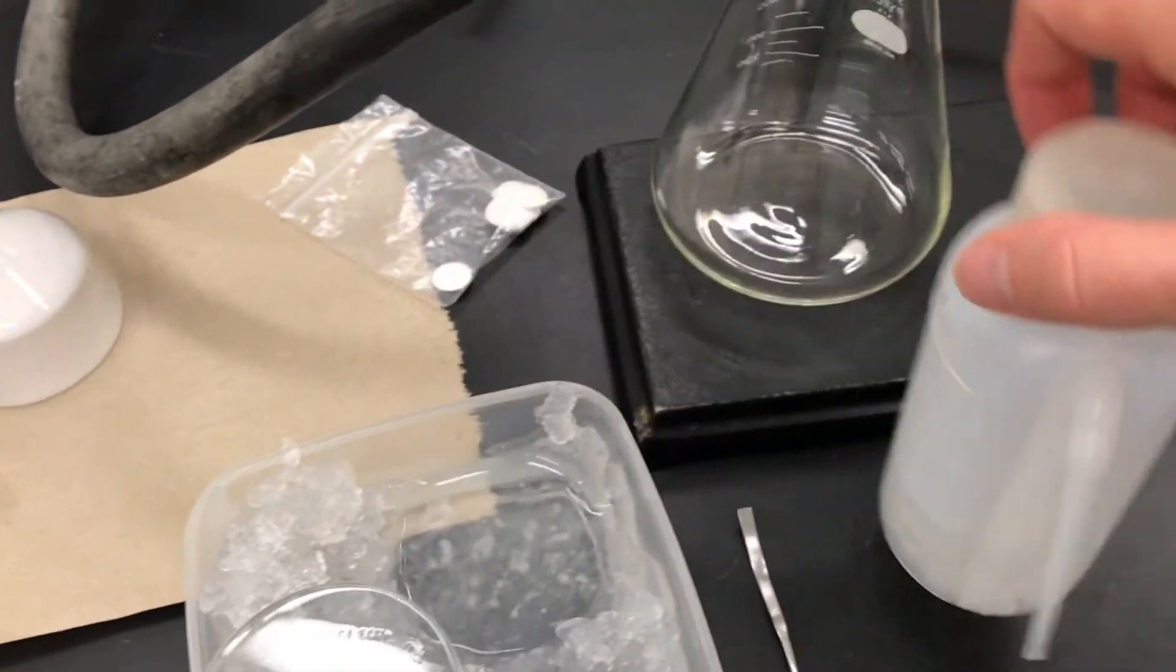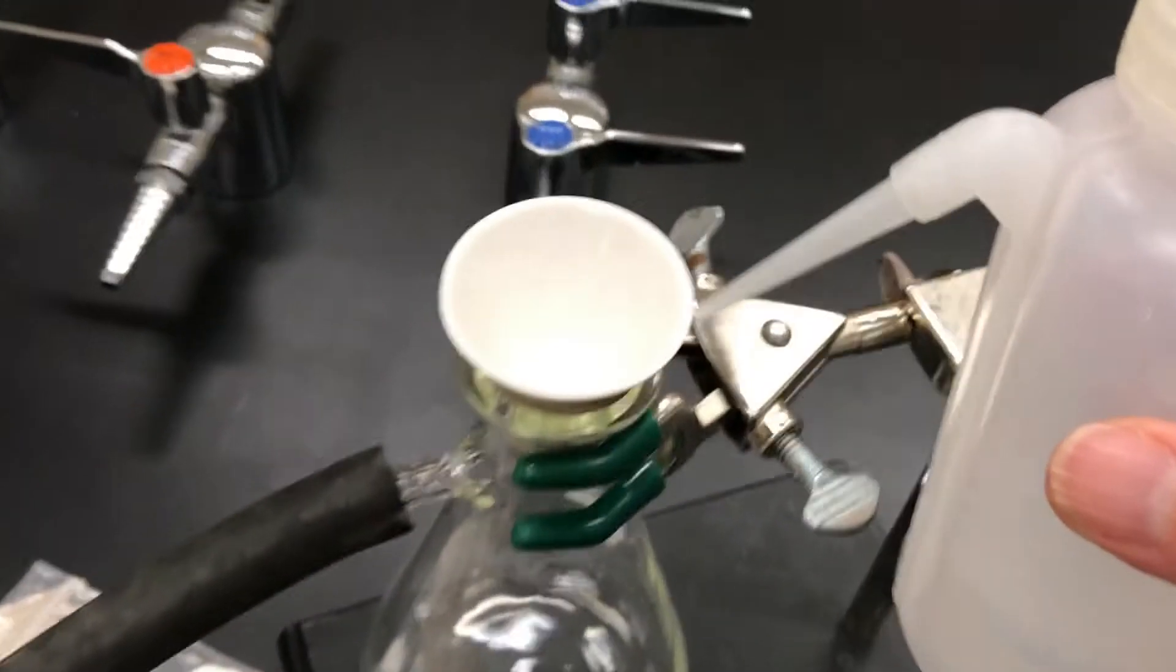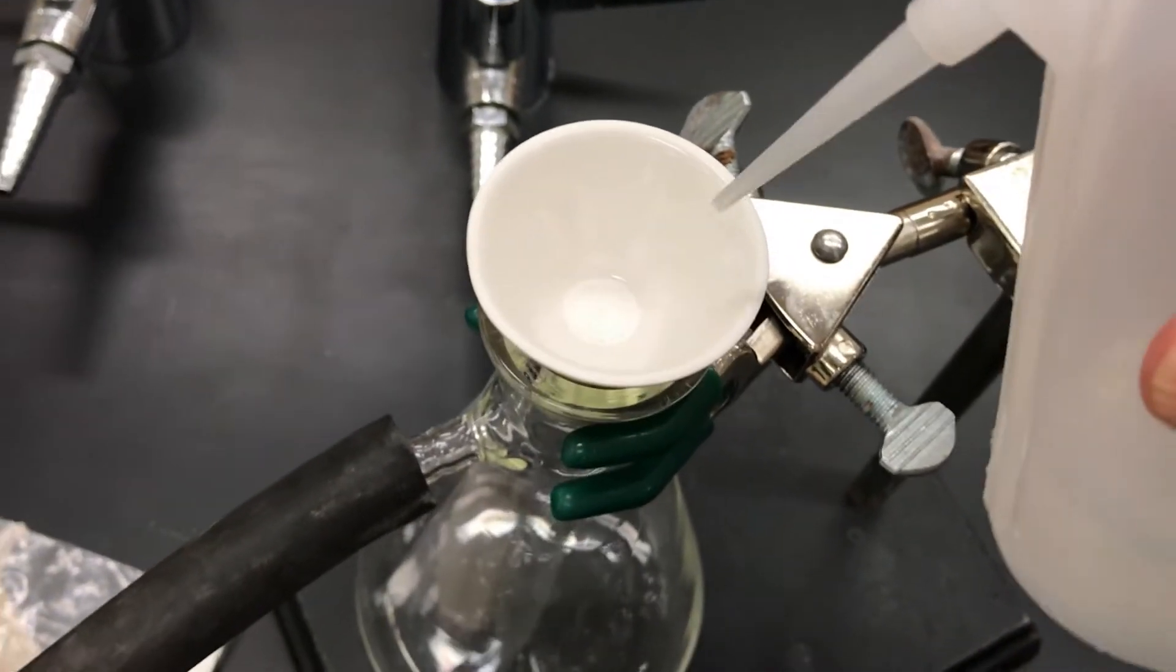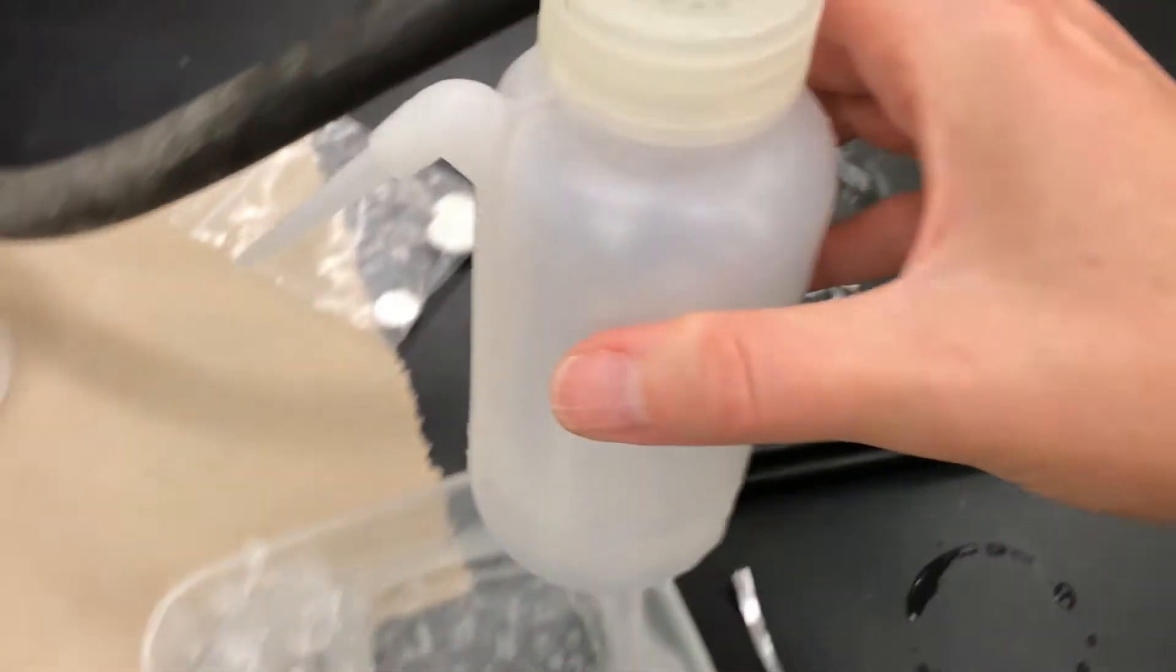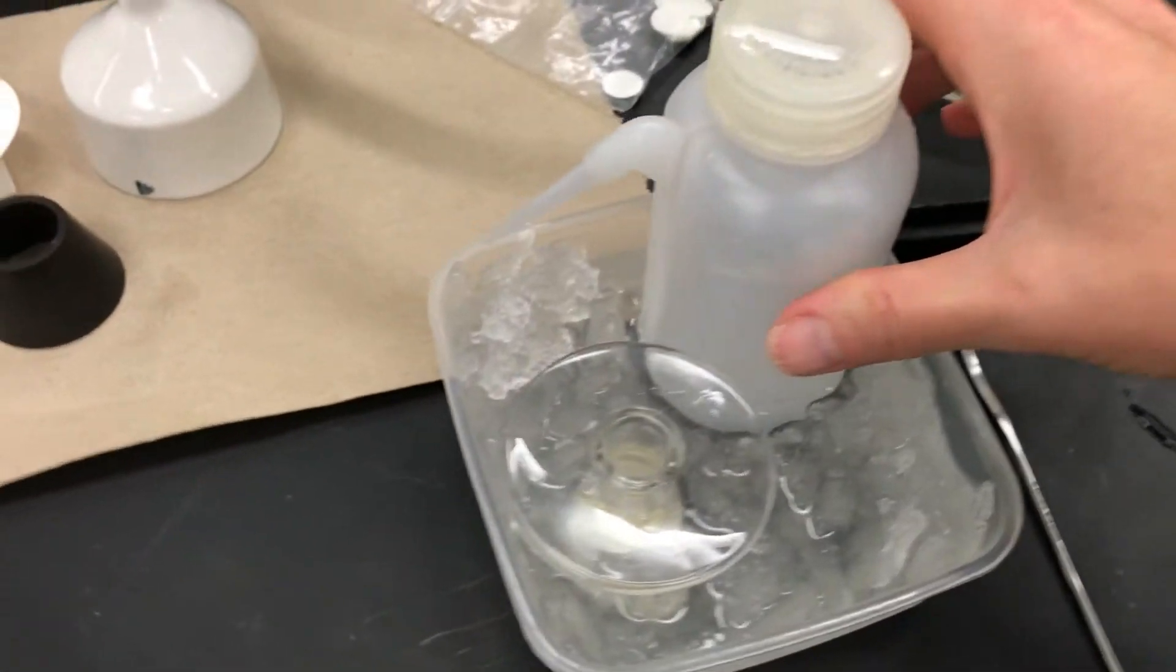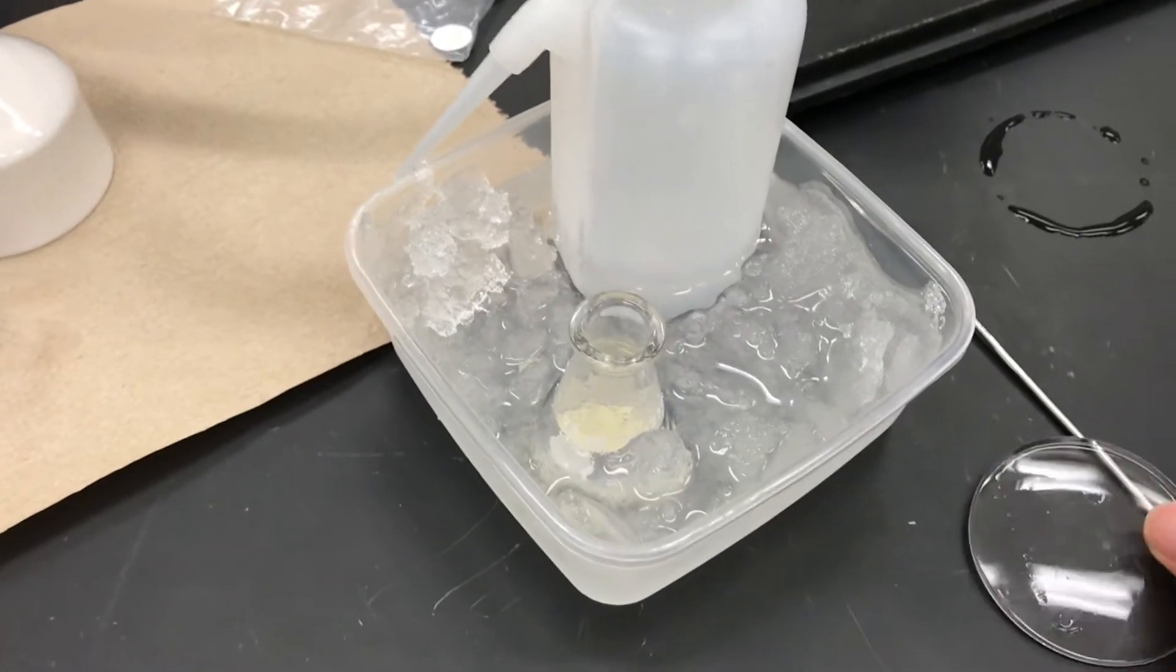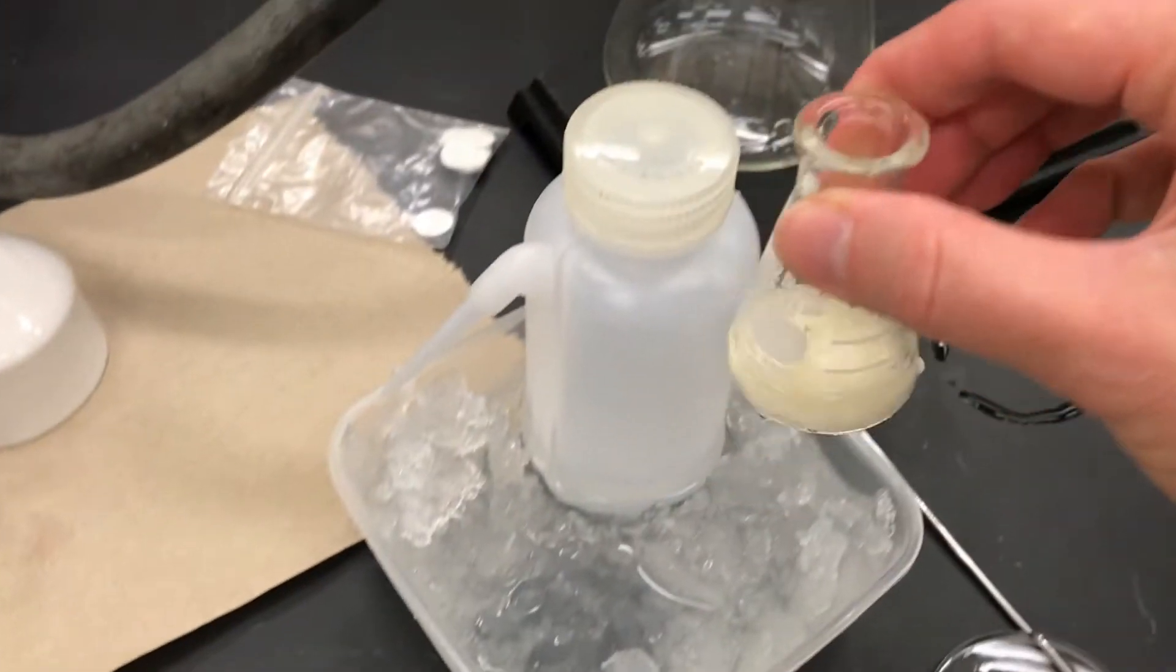Then you take some of your solvent and you first add some of that to the funnel and wet the filter paper. That liquid is going to drain out, but the point is that it holds the filter paper very securely onto the funnel, and now we're ready to start filtering.